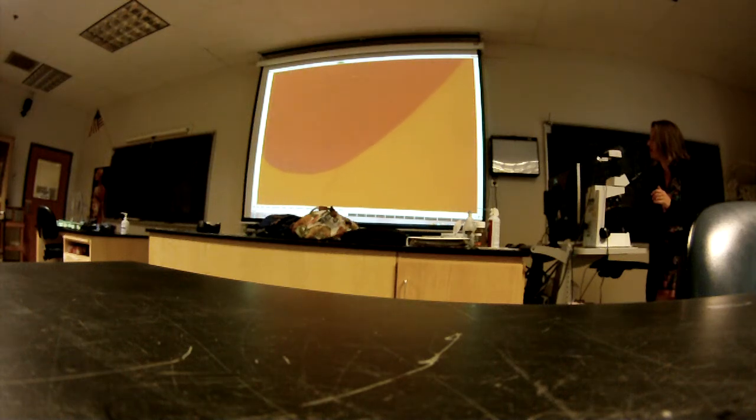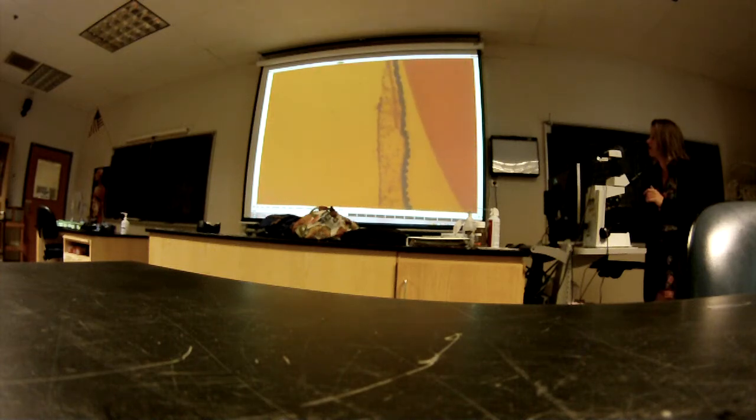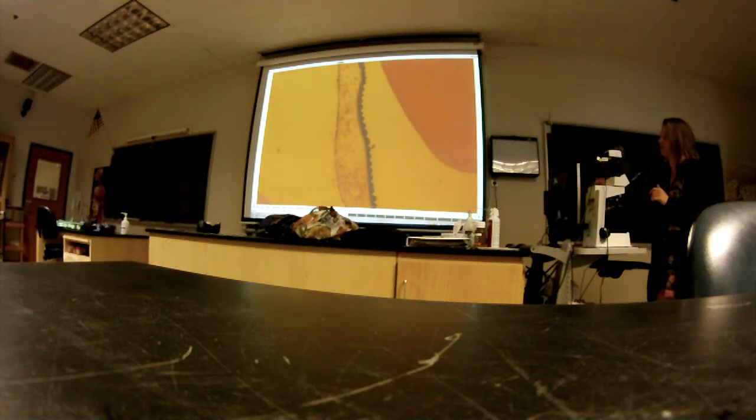Okay, and then on the posterior side of the lens, there's quite a large space. What is this space called? Posterior cavity. Yeah, posterior cavity. Okay, and then we did the cornea, the ocular conjunctiva right there, and the anterior cavity. We move posteriorly. We have this pigmented structure. Iris. Yeah, the iris. So here's the iris.